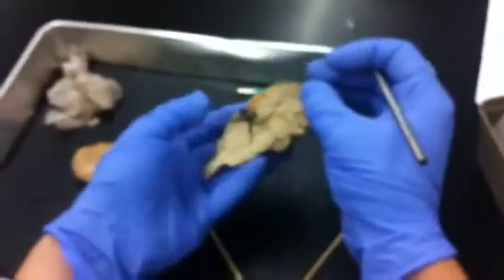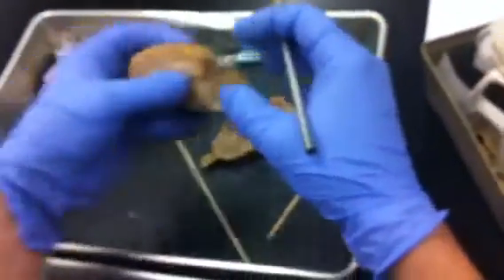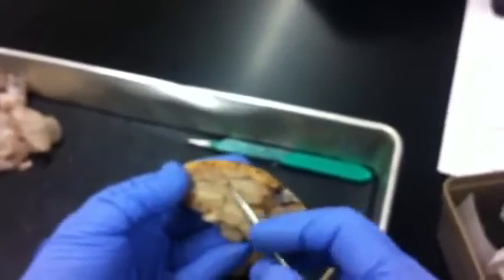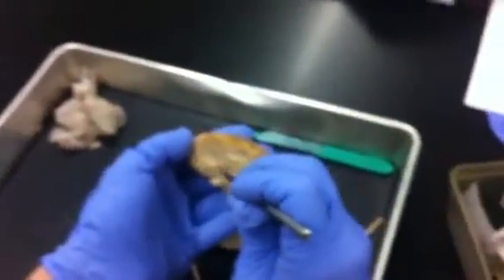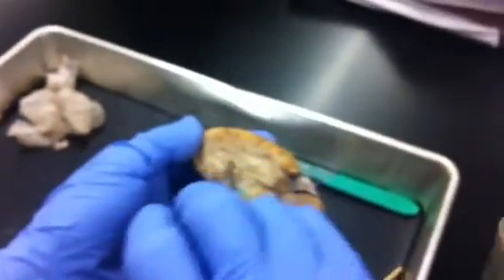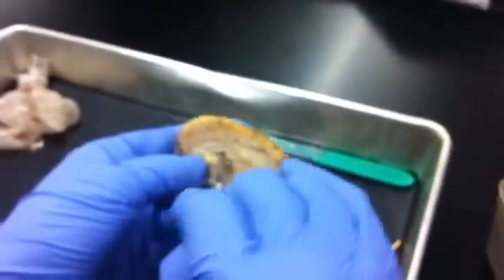Okay. Now for your ventricles. Okay, so I'm going to go to this guy for a second. Your lateral ventricles, remember, are inside of here, in there, and inside this cerebral hemisphere. But you can feel them if you take your probe and go in right underneath the corpus callosum, stick the probe straight back and go up. You can feel an empty space up there. The lateral ventricle doesn't have anything to do with the corpus callosum. That's just where I'm going in to feel it.